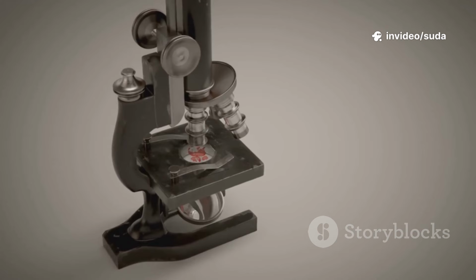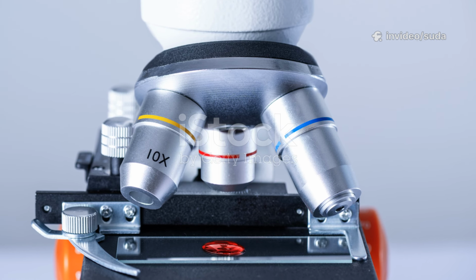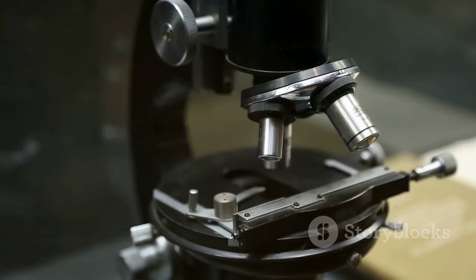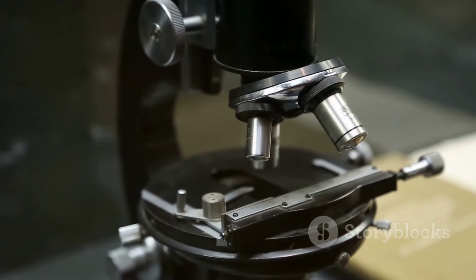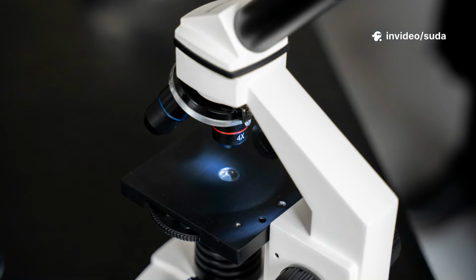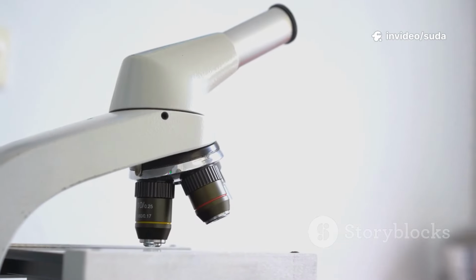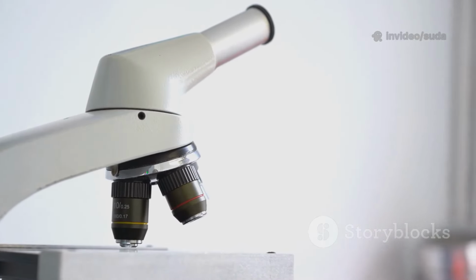It's called a microscope. Microscopes are like magic windows. They take tiny invisible things and make them big and clear. They let us see the building blocks of life itself, from the hair on your head to the dust on your shelf. A hidden dimension is waiting to be explored. Understanding how to use this tool correctly opens that secret world to everyone.